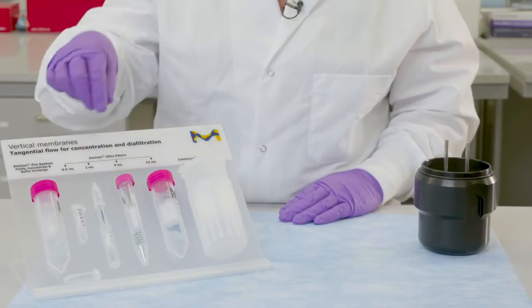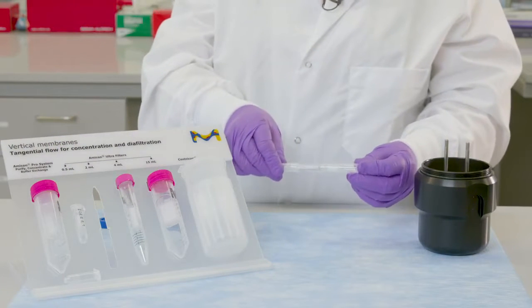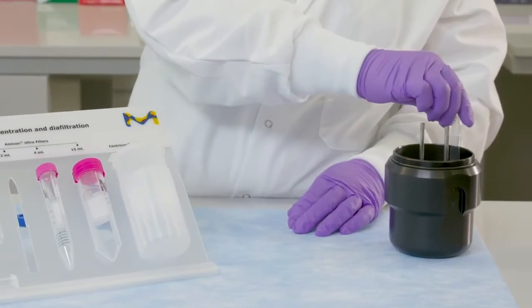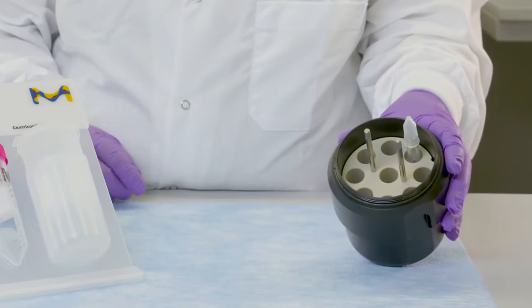The Amicon Ultra 2 allows for 2 mil filtration and can reach concentration factors of greater than 100x. Centrifuge with a swinging bucket rotor or fixed angle rotor with wells and carriers that can accommodate 17 by 100 millimeter flat bottom tubes.